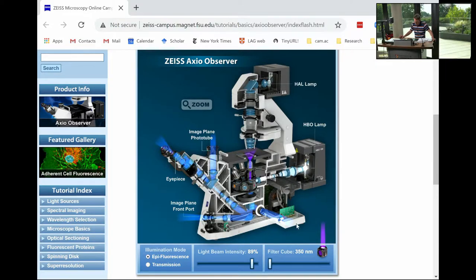And for that, you might use the light source as shown down here. The light is reflected off what's called a dichroic mirror, which is sitting in these little filter cubes down there. It will select a certain color. It goes through an excitation filter. I've shown this in one of the early lectures. And then the right color is sent through the objective onto the sample. And this excites fluorescence light in dye molecules that are inside the sample.